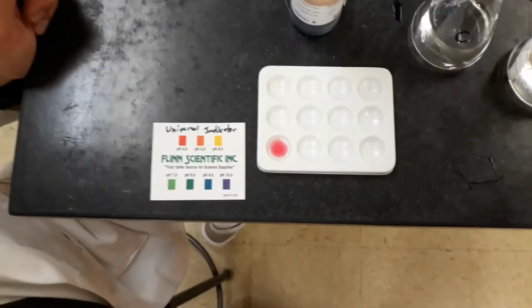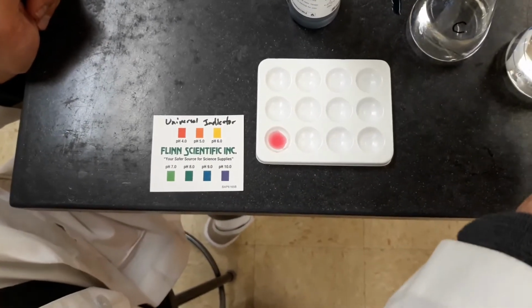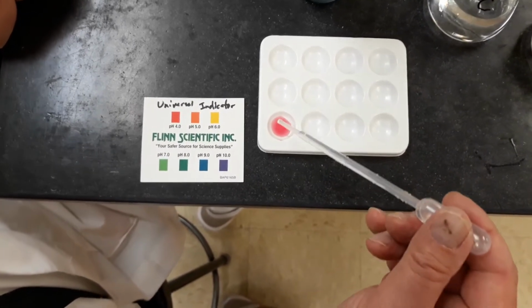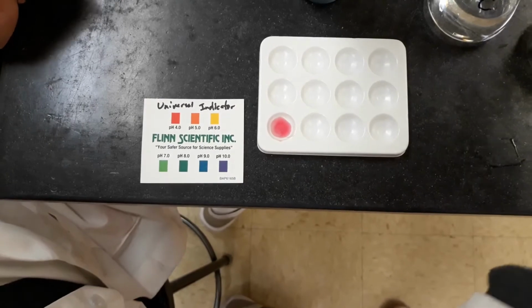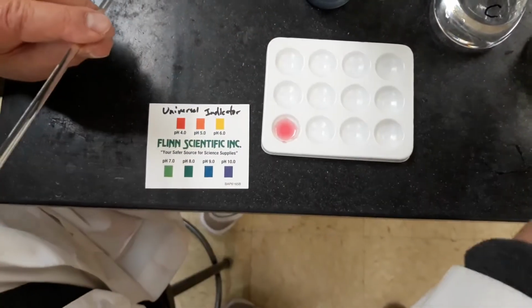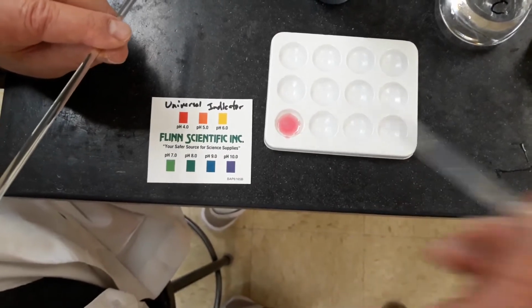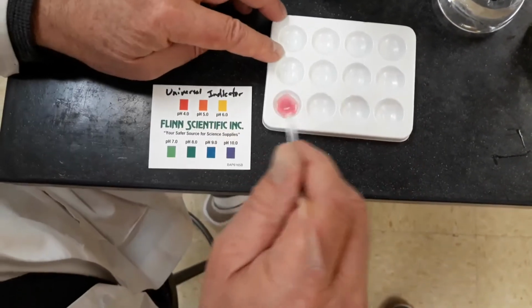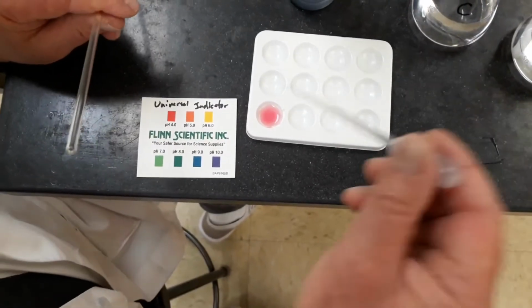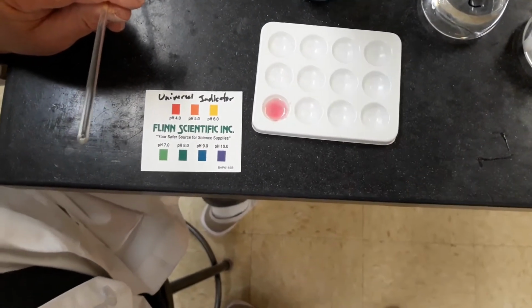And then we're supposed to add, drop by drop, D to C, and note the effects. There's the 3rd drop.